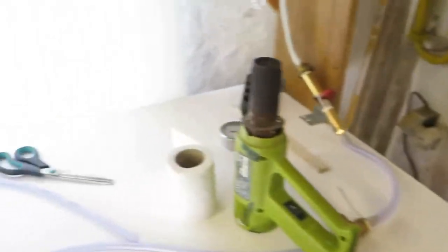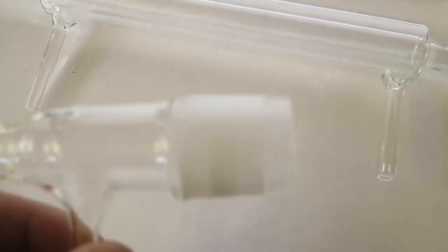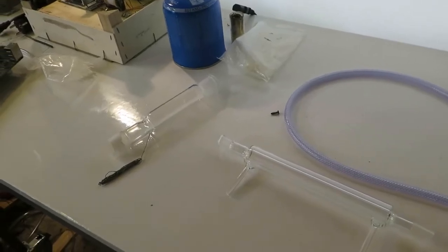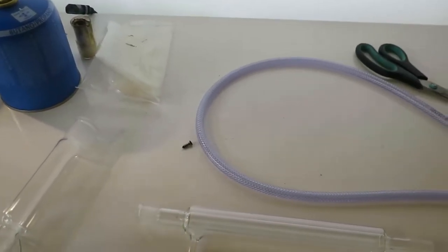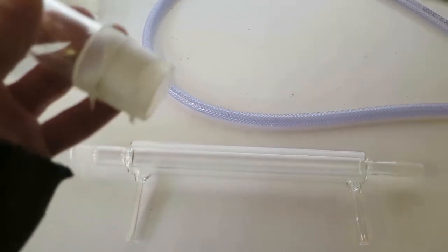As I said, I have tried to do vacuum distillation, and I have used these joints wrapped with Teflon tape to make a seal, and it works pretty well actually. It holds vacuum quite well, but vacuum grease would be much better, I would say, because you touch this and it's immediately messed up.